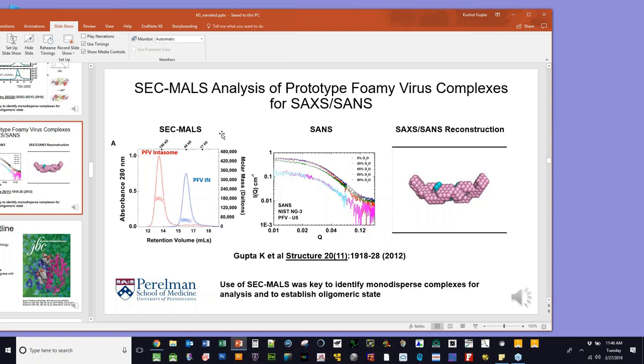interpretation of mass. In our study here, not only did we have SEC-MALS analysis, we also had centrifugation equilibrium analysis, sedimentation velocity analysis, some dynamic light scattering information, and again, we could do a lot of checks to make sure we were nailing down the stoichiometry from different angles, pun not intended, to nail down the stoichiometry that we were determining.